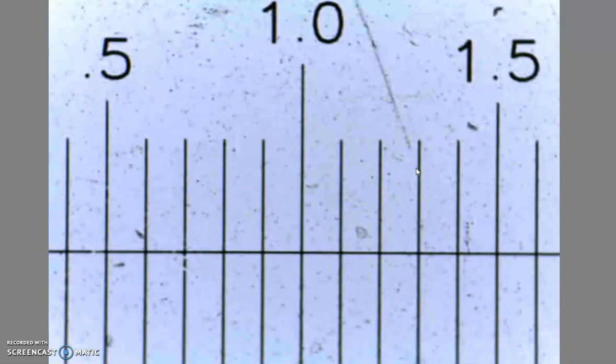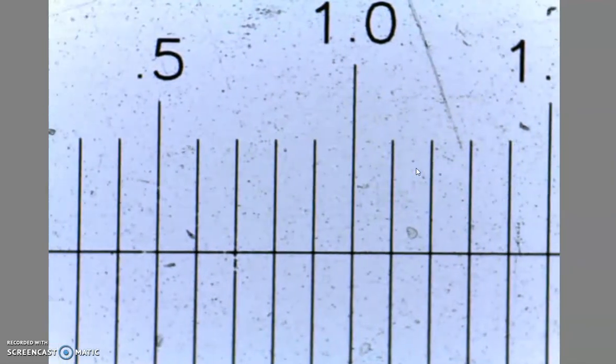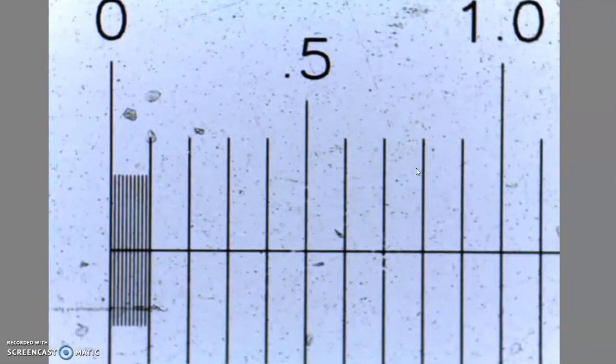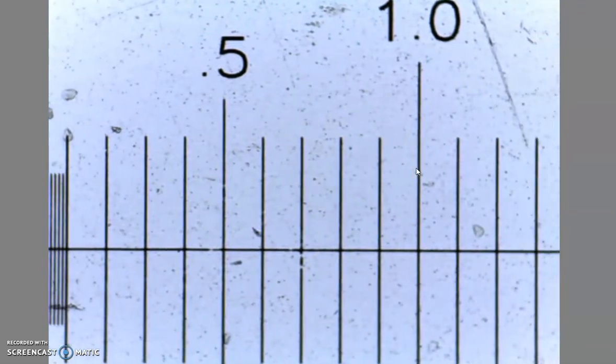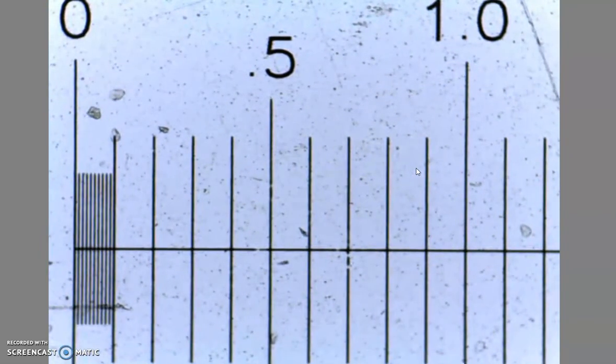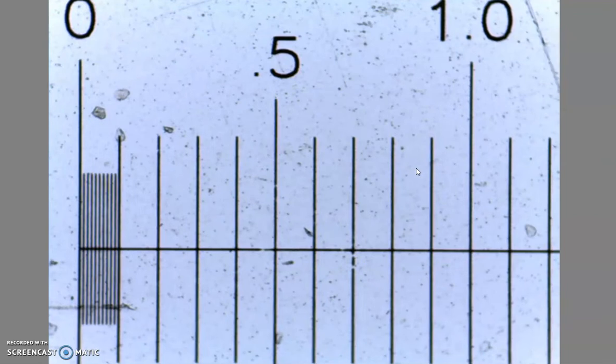We need to adjust our fine focus a little bit so we can read this more clearly. Then we need to line this up so that we can measure accurately. Again, you'll be using the mechanical stage knobs to move this around. You'll find the 0 here. What you'll need to do is get that 0 as close to the edge as possible, which again on your scope will be a little easier.